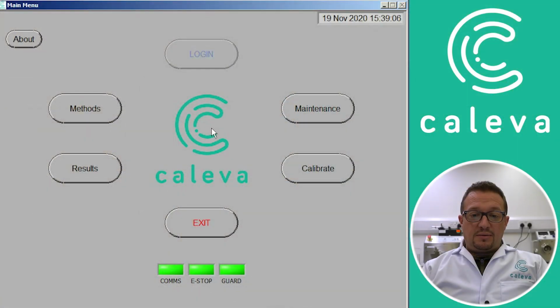This is important as after the liquid binder addition phase, your liquid will permeate through the dry powders at a different rate depending on your formulation. If you undermix, you can experience inconsistencies throughout the batch in your production granulation equipment. If you overmix, you can start to force the liquid binder back out of the powder again and again experience inconsistencies. So to begin our experiment, we need to create a method.